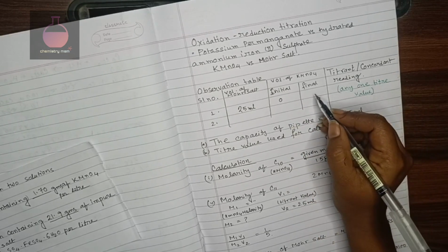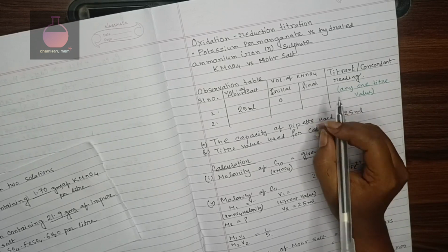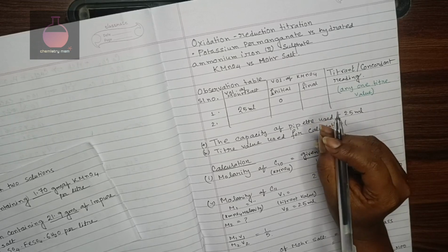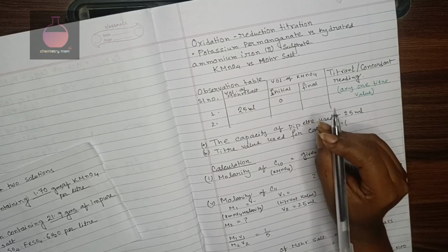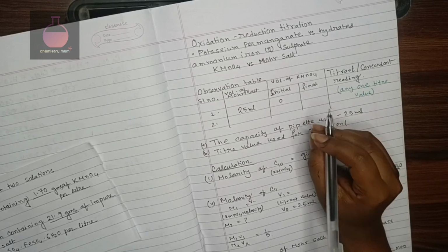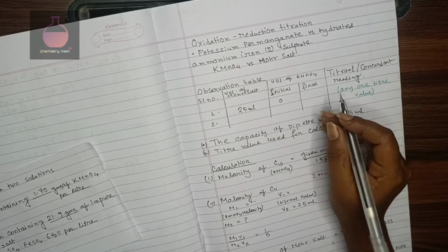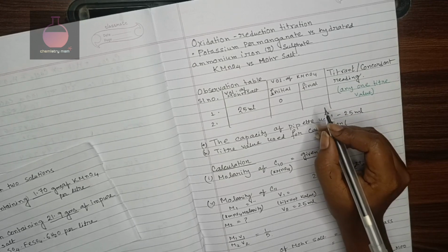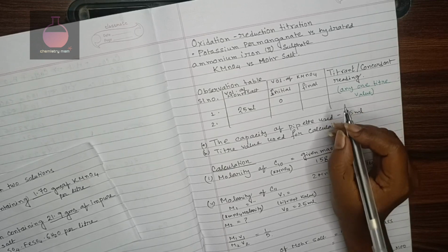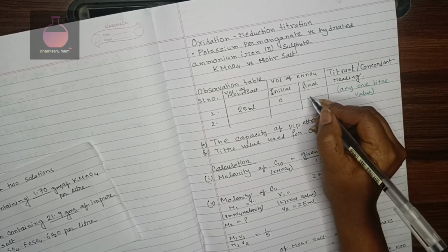The final one, whatever value is coming, is not a particular one and there is no such range. It all depends on the value written in your question, meaning how many grams are taken to make the solution. It is not mandatory that the range comes from 24 to 27 or like that. Don't make such a thing. Don't keep this idea. You will do your work, then only you will get your value.